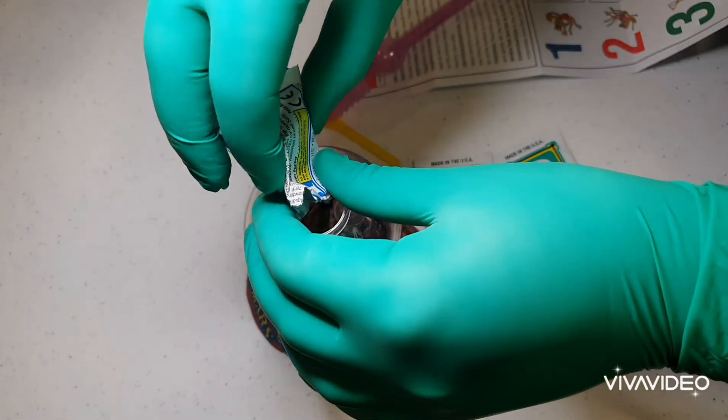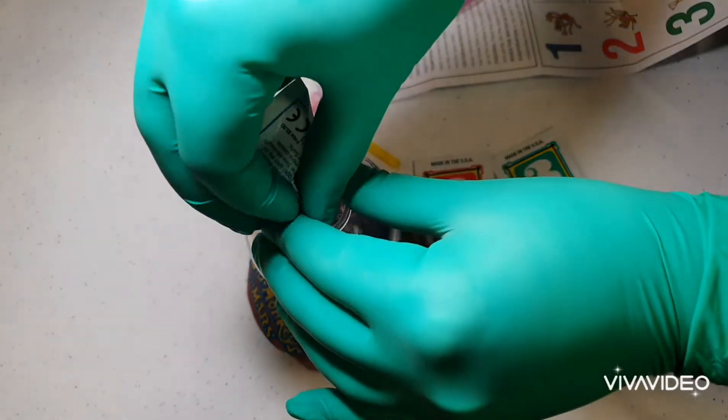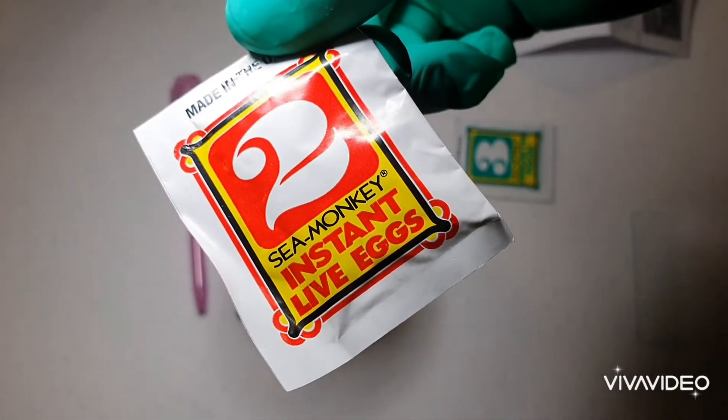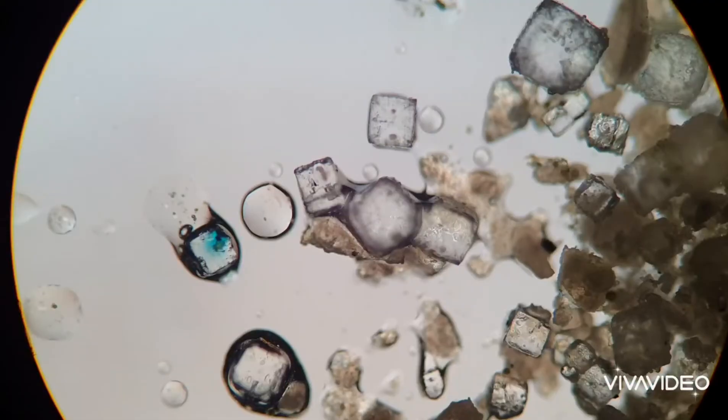So as a nice little treat, I thought I'd buy some sea monkeys and pop them under the microscope. In this video, and in a few more to come, I want to document the whole process. And so this is part one, where I look at the eggs of the sea monkeys.